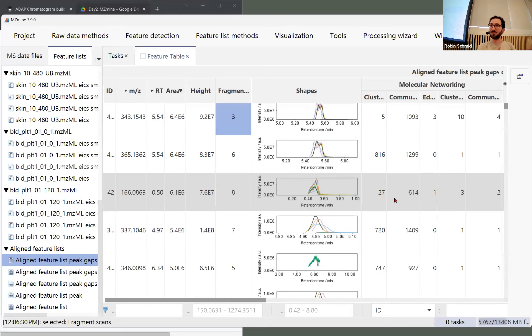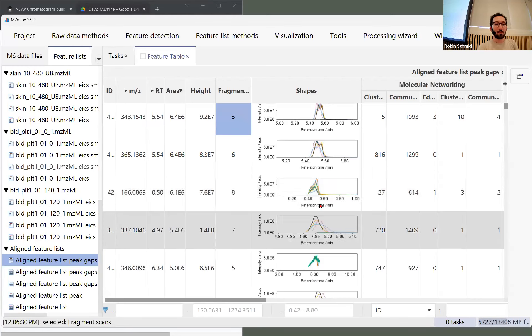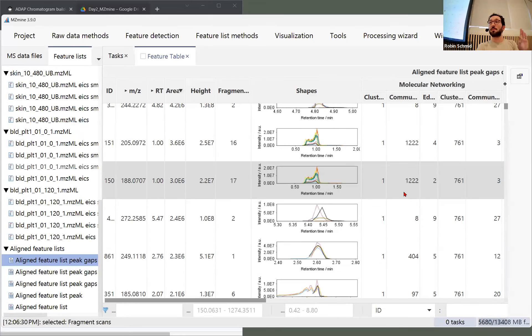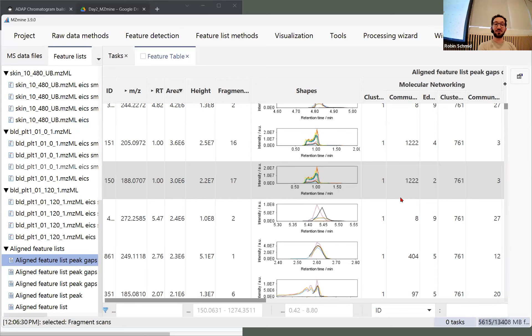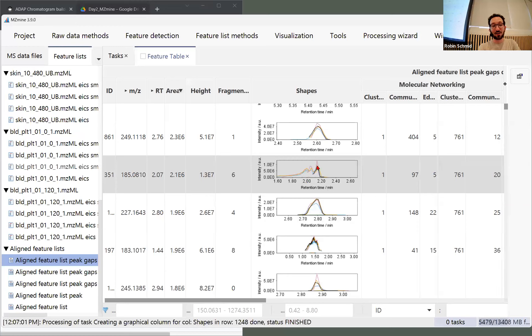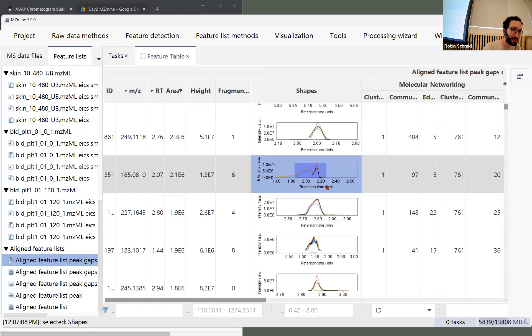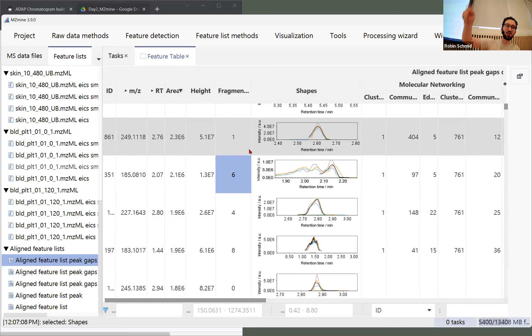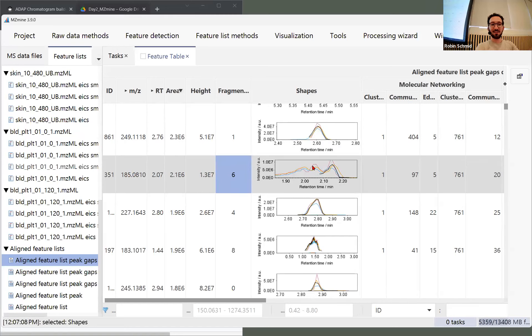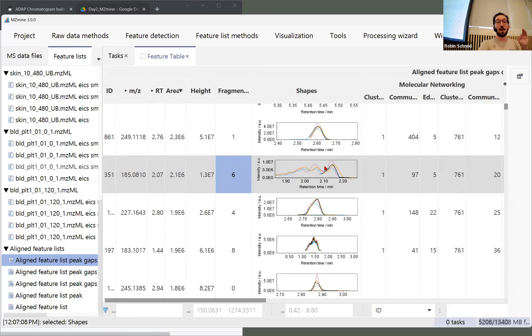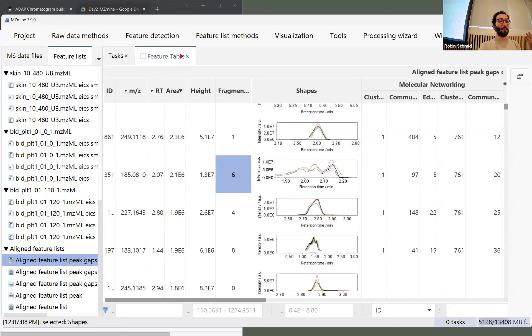If the shapes change there might be a problem in the chromatography. But it looks pretty good here. This is only a representative set of samples — if you do different batches, try to get a representative number of samples into the optimization. Sometimes things are not separated: in the black sample it created one feature, but in the other samples the separation was not clear enough and it failed to split them. We can go back to the parameters and optimize this later.